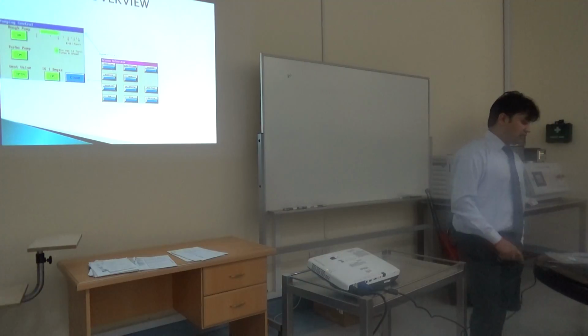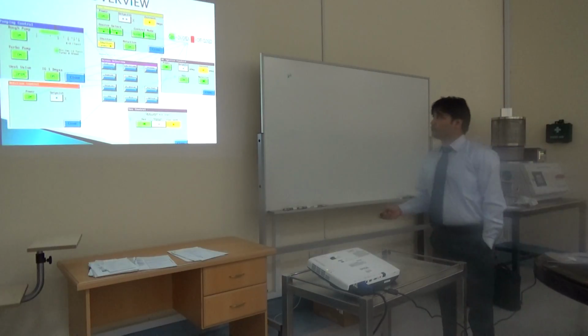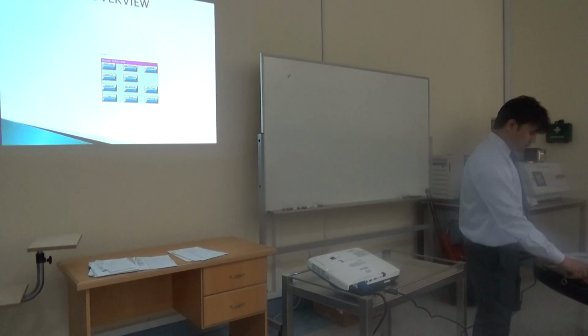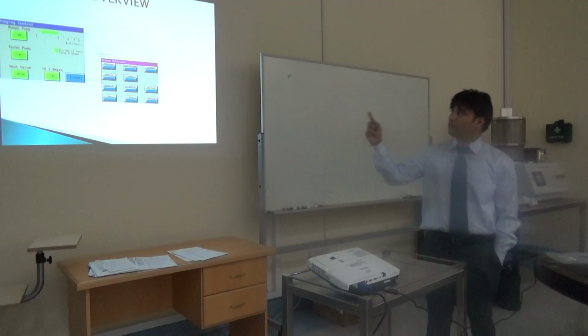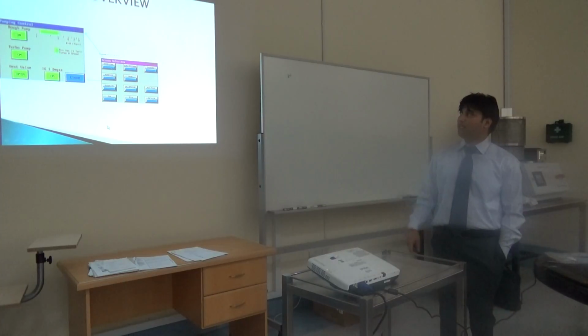Okay. Now, in one screen I put all the displays, just to look at how it will look if you touch them. I just put all the displays. This is the screen selection, and after that, I'm explaining one by one. If you touch this pump control, it will show this display, like rough pump, turbo pump, vent valve, whichever you want to turn on. From here you can manually control your vacuum, and apply the air pump with the help of this pump.